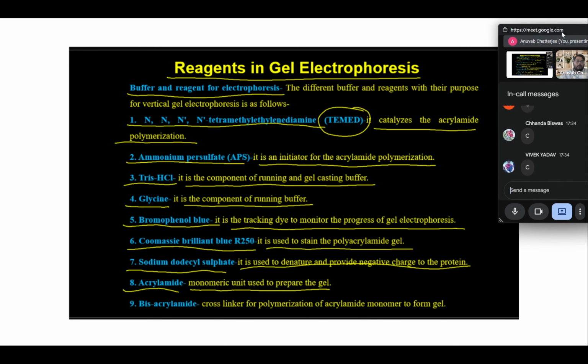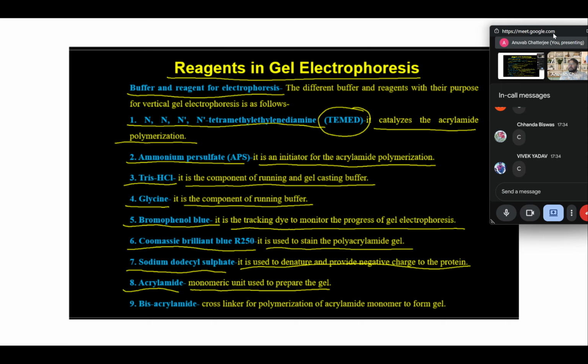So now we come to how to make the gel, which is another thing. Does anyone have any questions regarding how Western blot is done by now? Then we get into details of how the gel works in a Western blot.